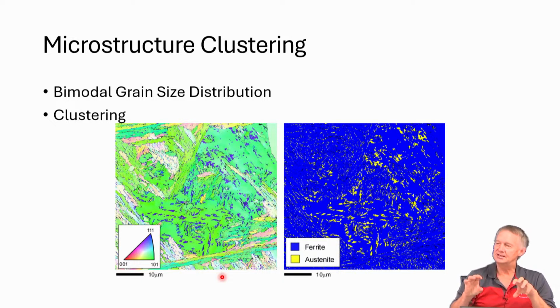So if we take a single pattern and we don't know which one it is, FCC or BCC, and then we look at the confidence index for FCC versus the confidence index for BCC, one of them is probably going to be around 0.8, 0.9, maybe 0.7. The other one will probably be around 0.2, 0.1, right? Because you're going to get a lot of bad bands in one of them. The one that's not the correct solution is going to have half of the bands be bad because 2 out of 4 are different.